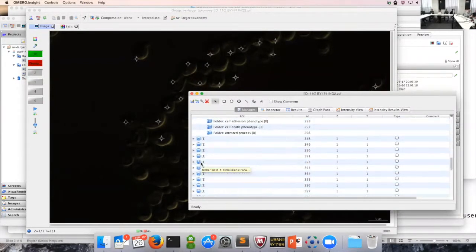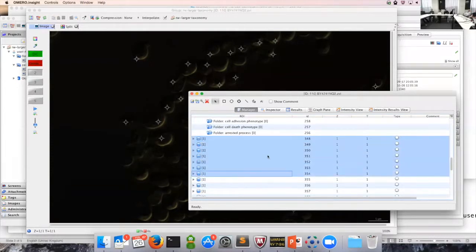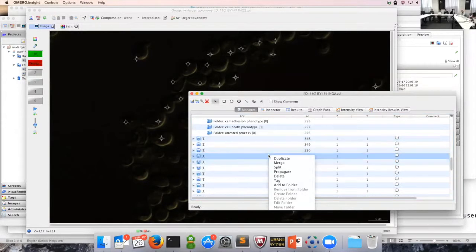We are just getting after going through these steps on every image in this group. Now let's select a couple of those points, and this is already going over to actually some Insight features, the UI features.